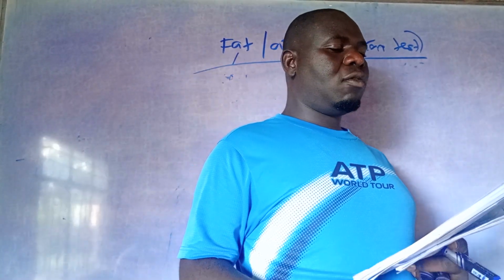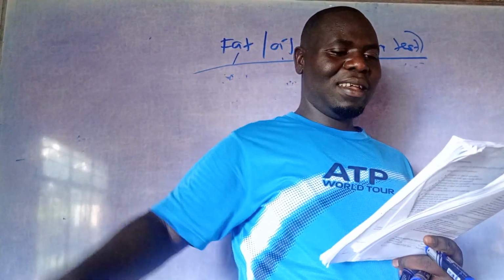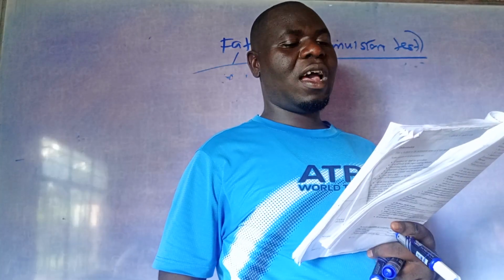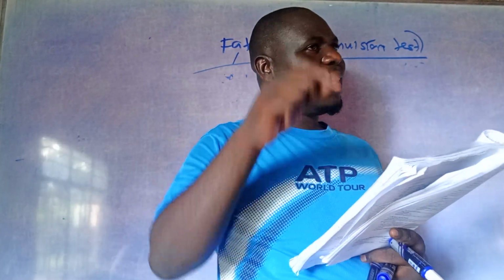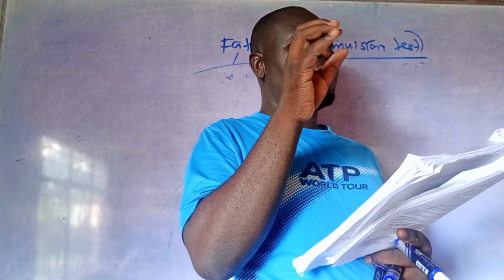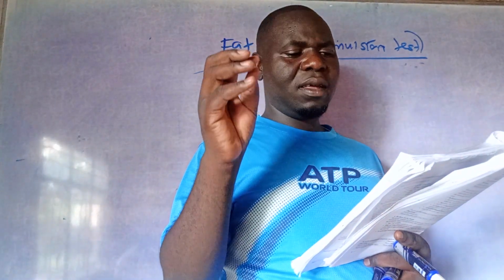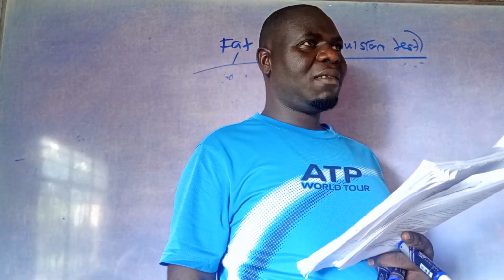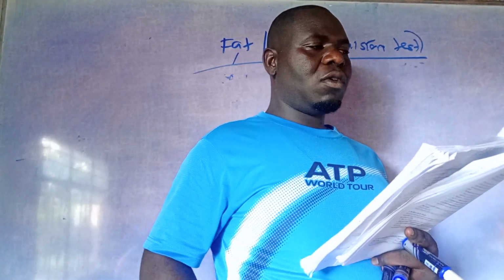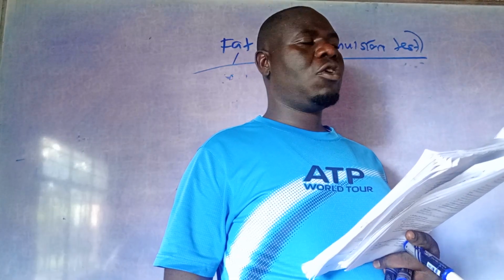If the solution remains clear, fats and oils are absent. So if the solution remains clear, fats or oils are absent.